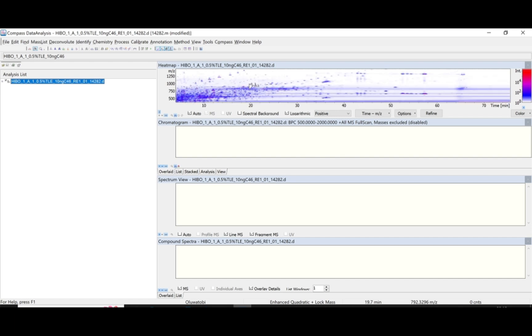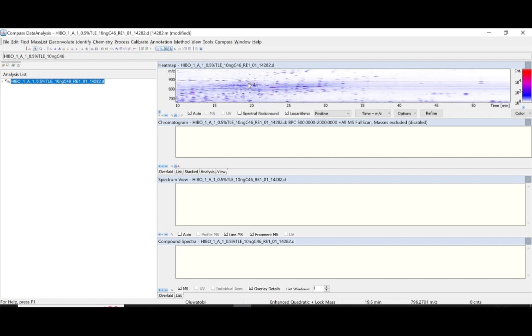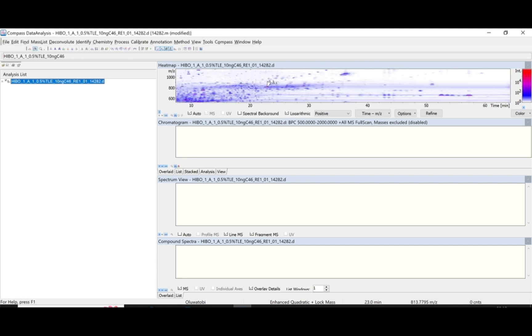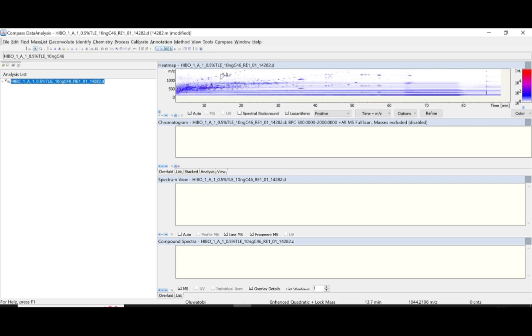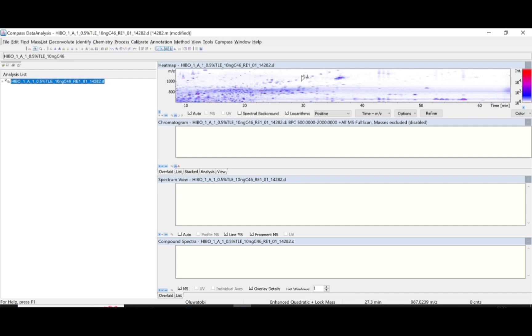Let's take a closer look at the heat map. We can see on the heat map some of these signals — some of them represent the compounds that we're looking for, while some of them are just mere noise coming from the lab work.